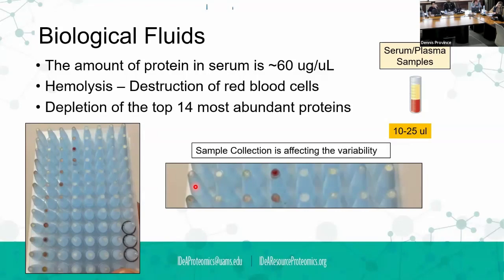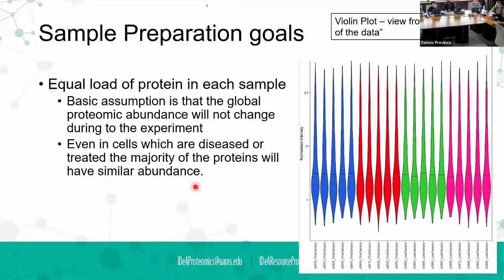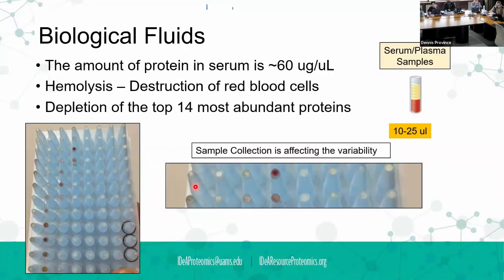It's another factor that this sample is going to have. The mass spectrometer is going to be occupied looking more at blood proteins and peptides than your sample. So that's why a lot of times when we do that for biological fluids, we like to deplete the top 14 most abundant proteins.